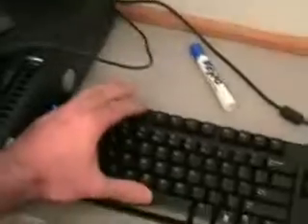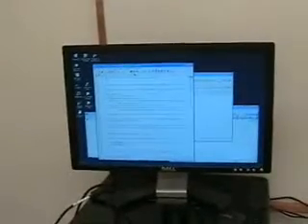And the script window, as you can see, will say Editor up in the corner here. So it's the editor for the MATLAB file, and the text will be green and sort of discuss the data acquisition file. You want to hit F5 in that window, so I'm just going to hit F5, and if we just wait a few moments, then several more windows are going to pop up which have the cameras set up on them. So now the thing that you want to do is arrange these windows.